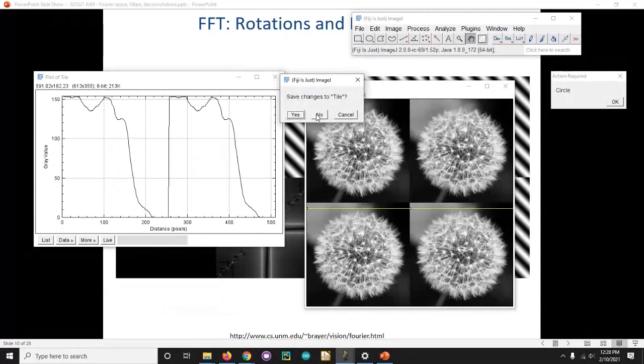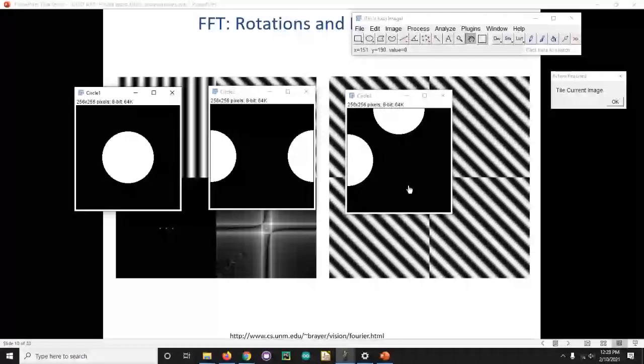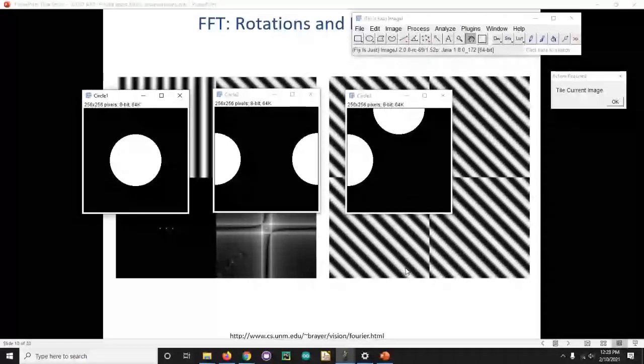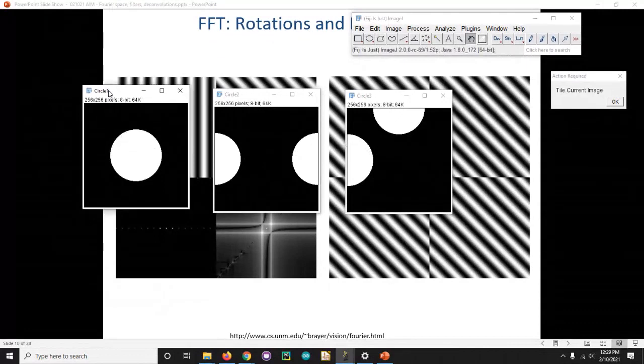So now we have 3 sample images. You can see we have an image with a circle in the middle, an image with circles at the edges, and an image with a circle at 2 corners. Now I can ask you guys, out of these 3 images, which ones would you expect to show an edge effect? You can type it in the chat. No brave souls. Okay, we got a few guesses. A lot of people are guessing circle 3, which is good.